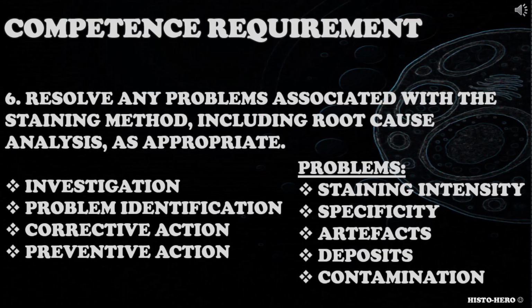Consider possible problems like poor staining intensity, poor specificity of staining, artifacts like uneven staining, hazy slides, nuclear bubbling, presence of deposits or precipitate on the slide, reagent contamination, and so on.